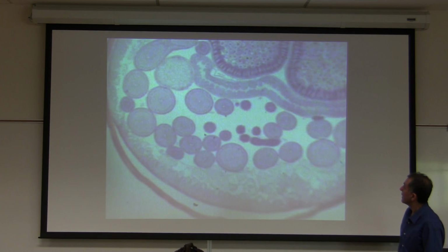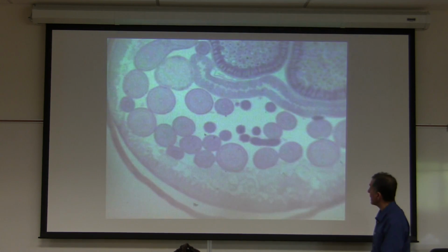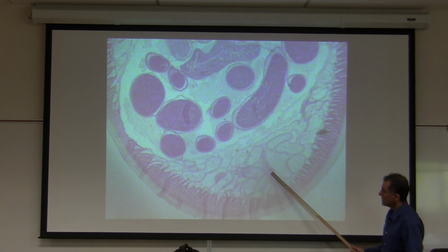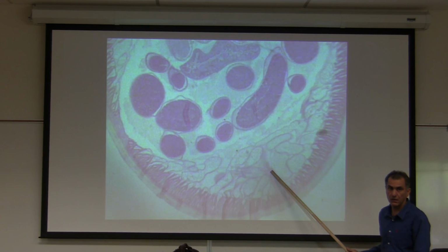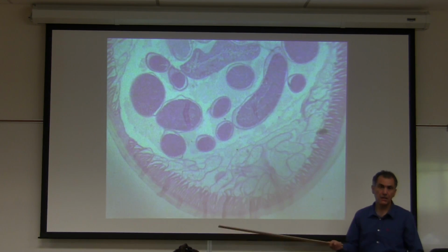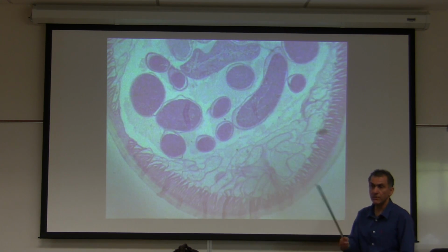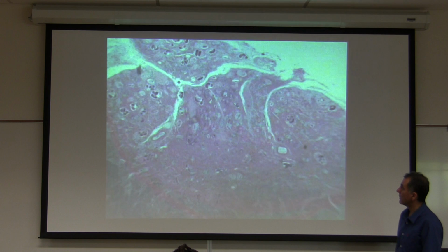Again, same thing. I don't see the nerve cord, longitudinal muscles. Where would it be? Nerve cord, the best one that you possibly would see is this one. You see a lot of longitudinal muscles are coming to the nerve cord right here. Okay, I have a slide. If you want to, I can show it on the microscope. I'll put it as a demo so you can take a look at it. I'll put it up here if you want. And you see the nerve cord. Okay, so we do have a nerve cord. You should look at your slides. So fine. If not, I'll bring my slide.